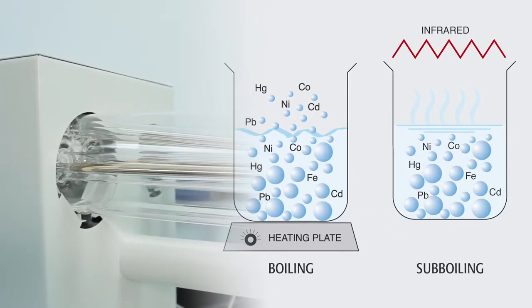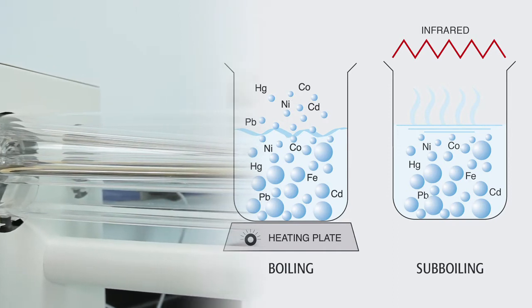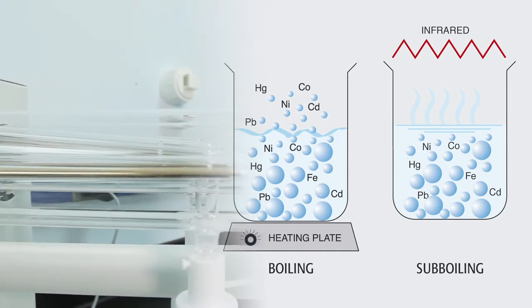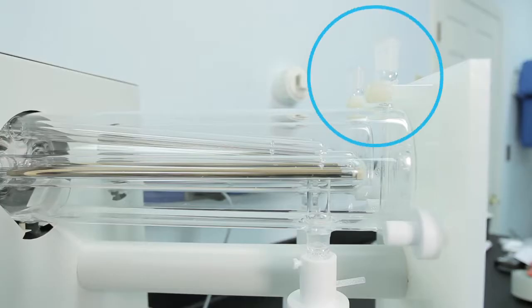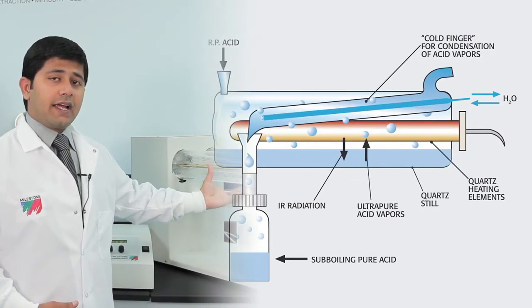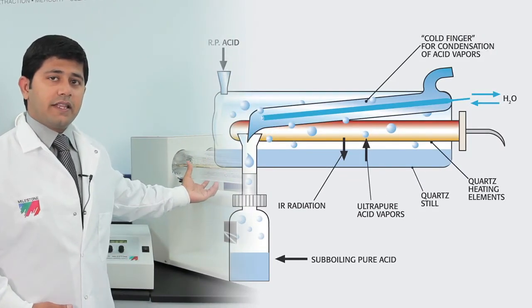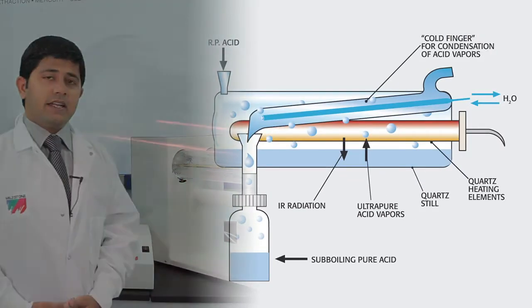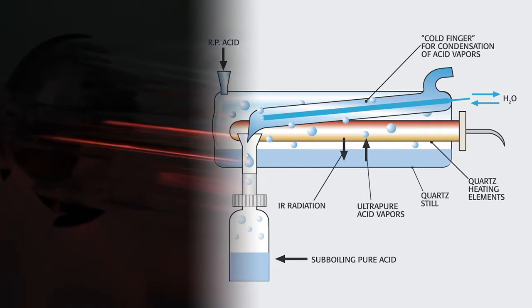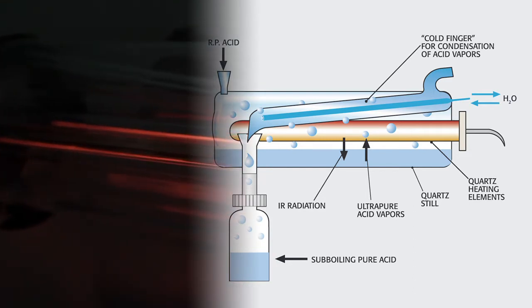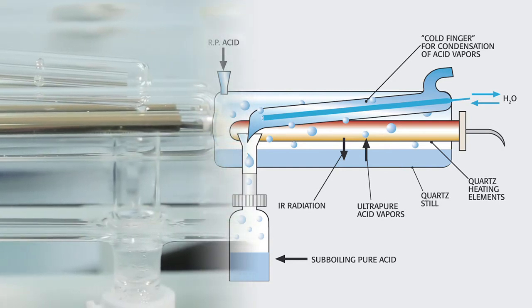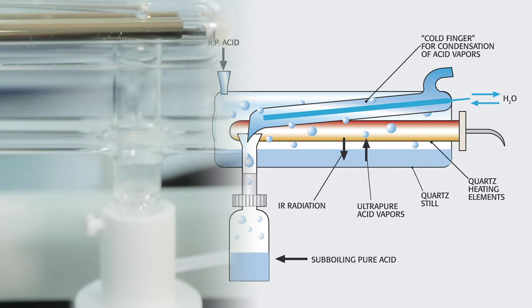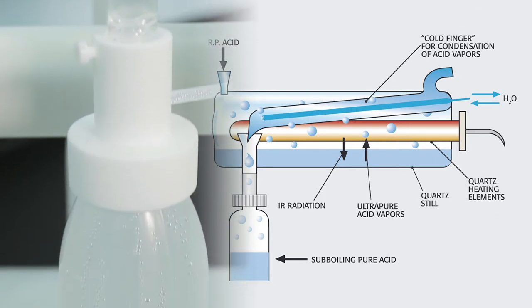So here's the DuoPure. It has two quartz stills that purify the acid using sub-boiling distillation. The only difference between the SubPure and the DuoPure is that the SubPure has only one quartz still. Reagent grade acid is added here, collected at the bottom of the quartz still, and then heated using an infrared lamp. The acid vapors from the bottom of the quartz still are collected on a cold finger inside the quartz, and the purified acid is collected in the PFA bottle.